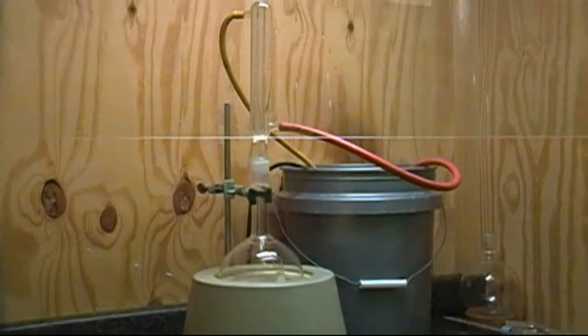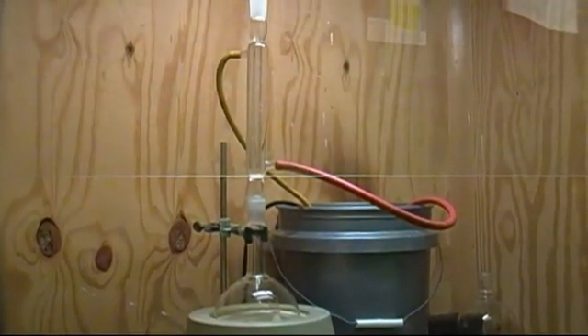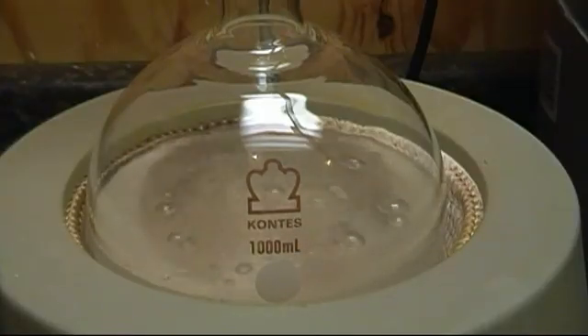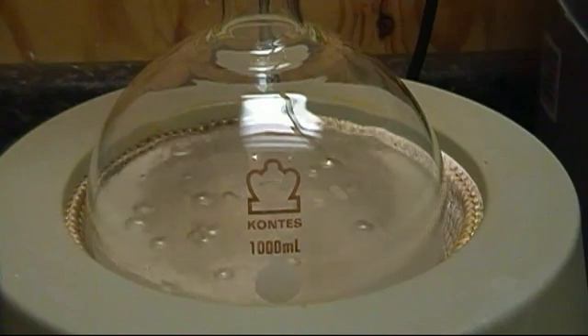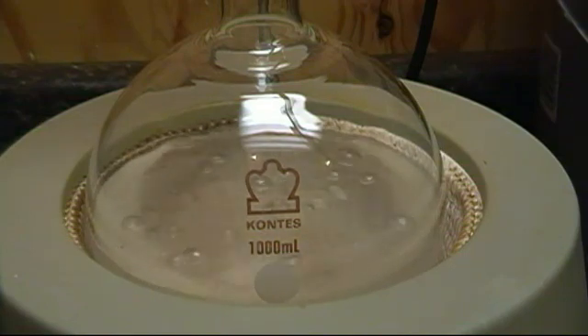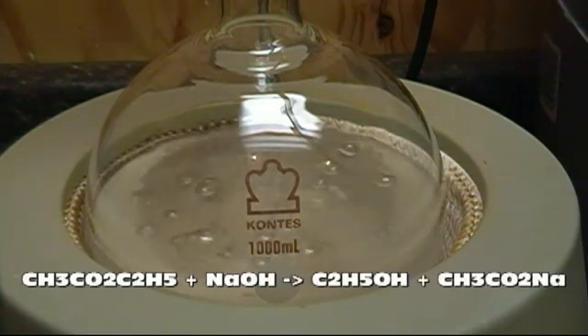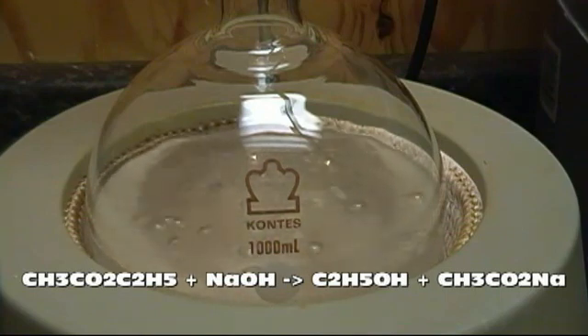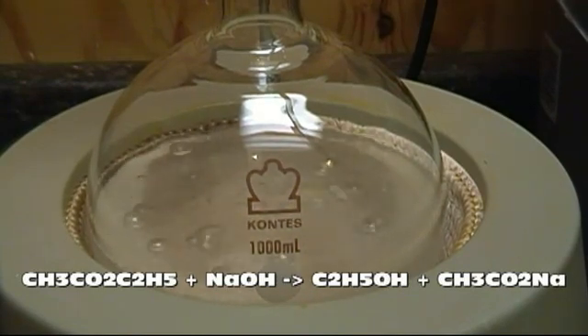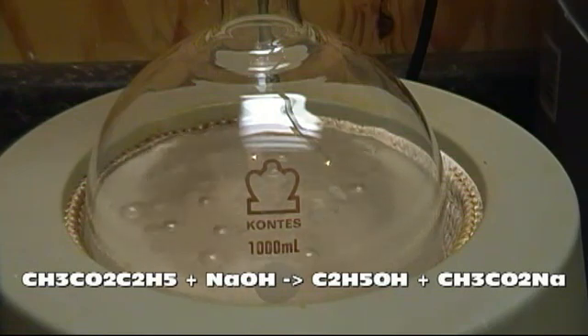So what are we doing here? When ethyl acetate is placed in water, a very small amount hydrolyzes, forming acetic acid and ethanol. If we add a strong base like sodium hydroxide to the solution, it will react with this small amount of acetic acid to form sodium acetate, also known as hot ice. Since the hydroxide is removing products from the reaction, and sodium acetate is unreactive toward ethanol, the equilibrium shifts to the right, and more ethanol and acetic acid will form. As long as there's hydroxide to react with the acetic acid, the reaction will go to completion. However, since not much acetic acid forms at any one time, you'll need to add heat to help the process along.